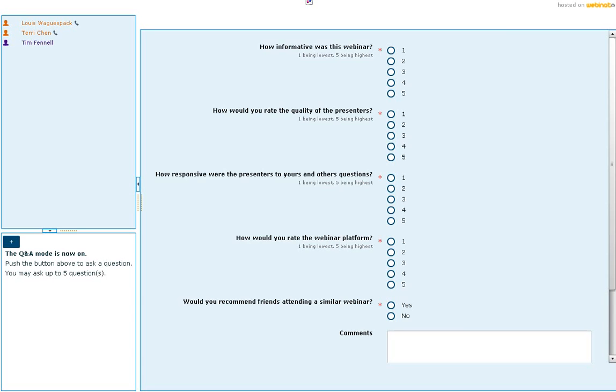So last question here. When you measure your sample in the humidity chamber, do you have to worry about the diffusion rate? Oh, that's a great question. I know there are a number of people who are interested in humidity measurements under humidity control, especially for measuring materials like caulk. You probably did not pay attention when I introduced this humidity chamber. When we perform a humidity control measurement, we provide our customers with different kinds of specialized accessories. When I introduced the measurement for the caulk curing, the geometry I used is not parallel plate.